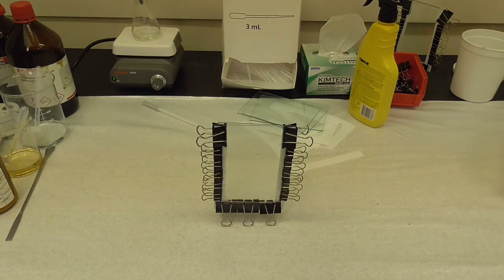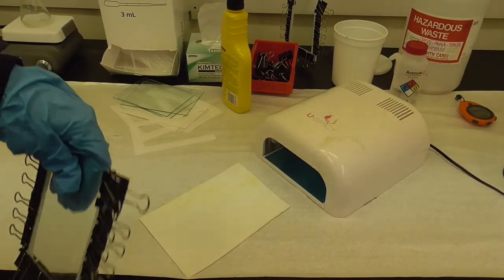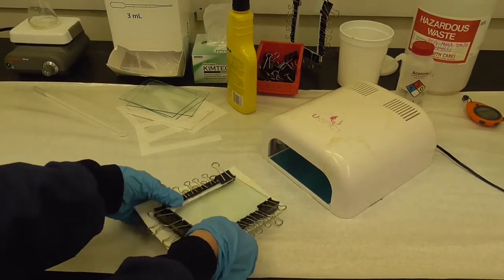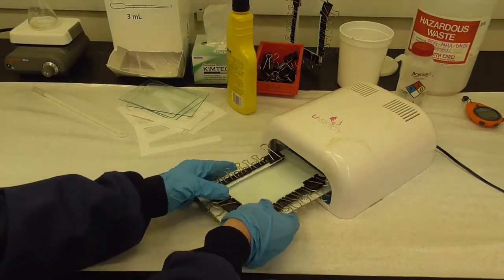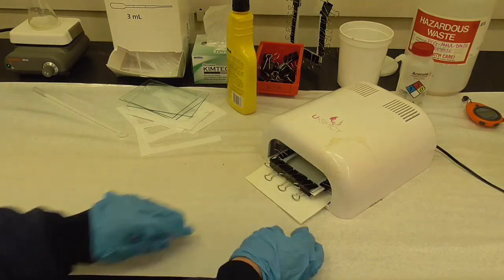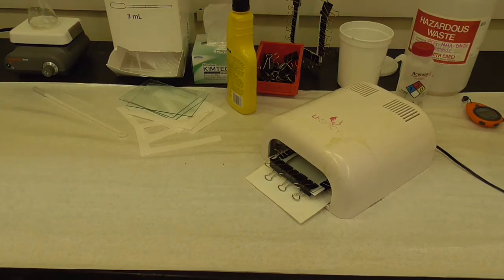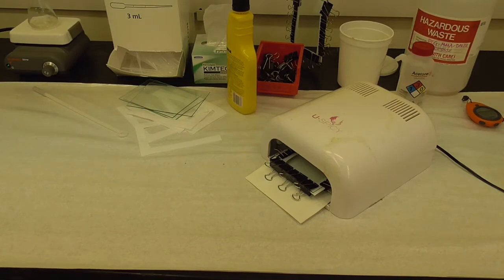So here's our mold. I'm going to make sure it fits in the UV lamp before putting polymer in. Here is the UV lamp and we will put these in this way. I put the piece of Teflon underneath in case it spills and push as far back as it goes. So it fits so I'm going to put the polymer in.